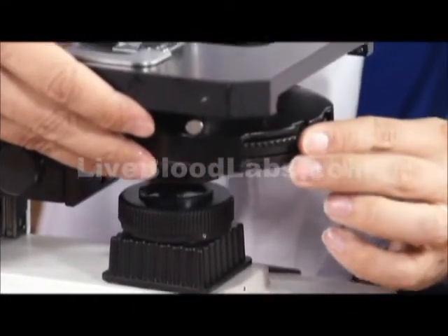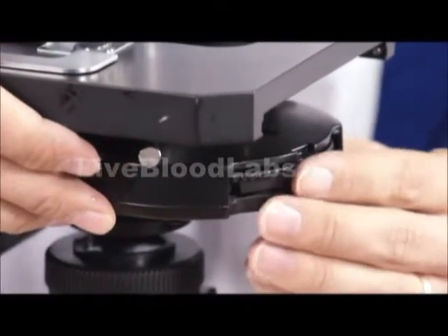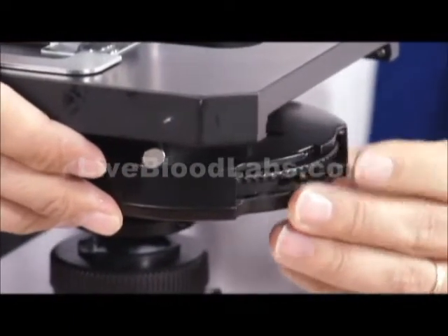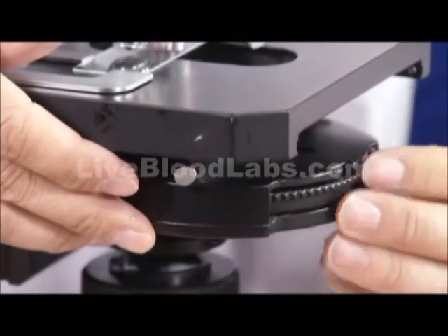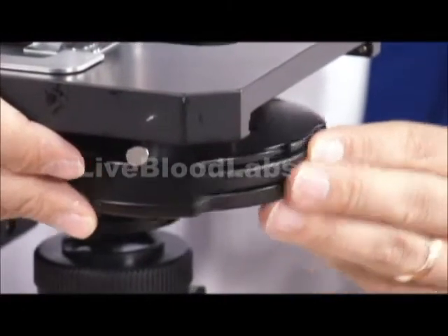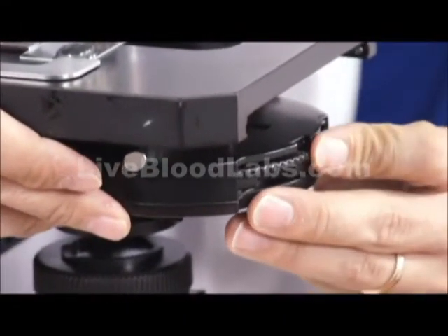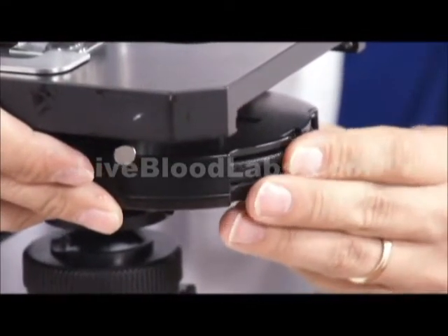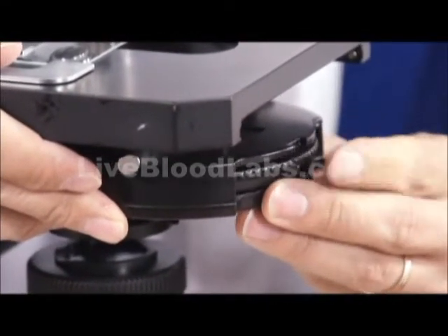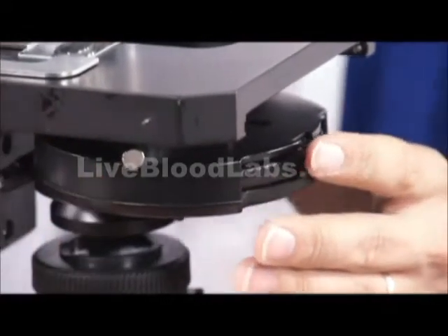BF for bright field, DF for dark field. It does have a dark field dry condenser setting. Where it says 100, that's for use with the 100x objective. 40 is for the 40x phase objective. 10 is for the 10x phase objective. And back to BF for bright field.